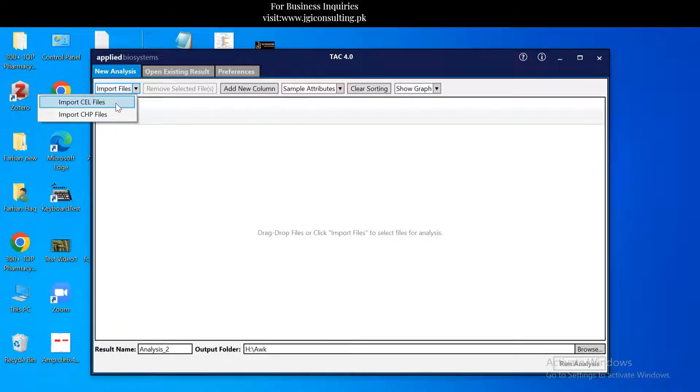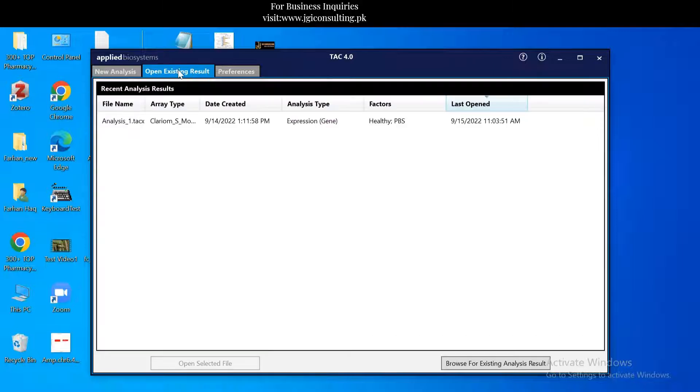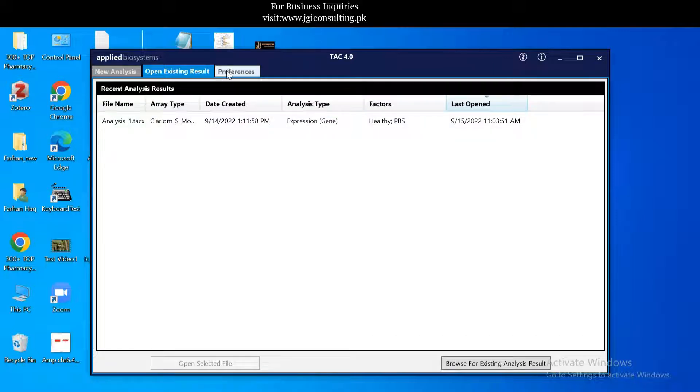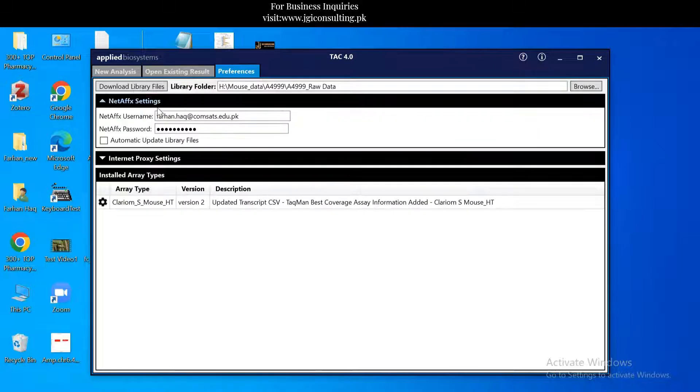CEL files are actually for Affymetrix platform. Since this software is for Affymetrix only, you can use import CEL files here and you can analyze your results and the preferences.